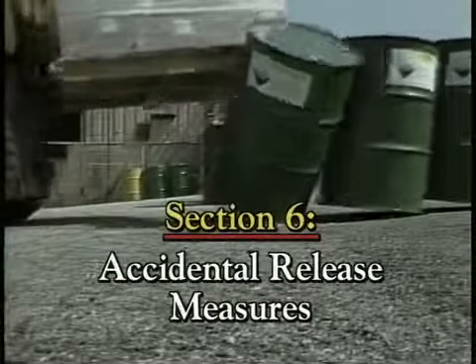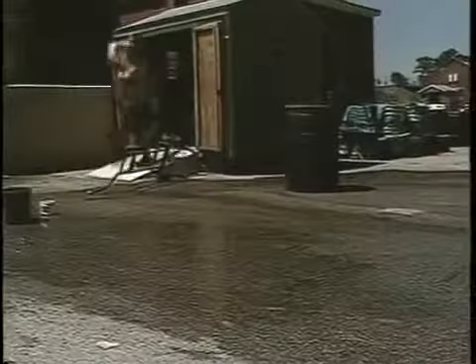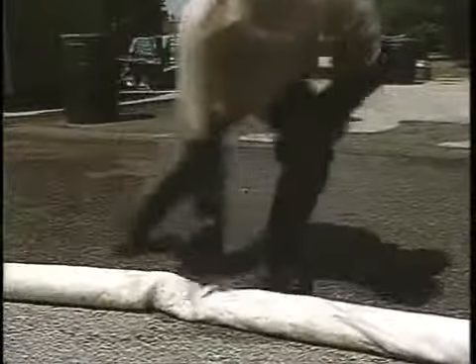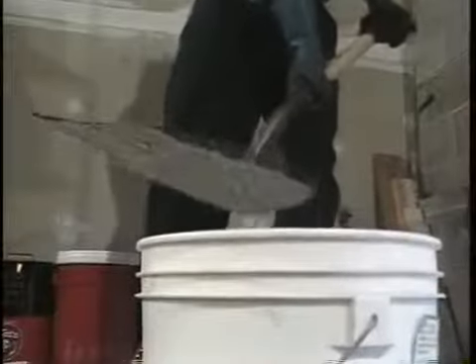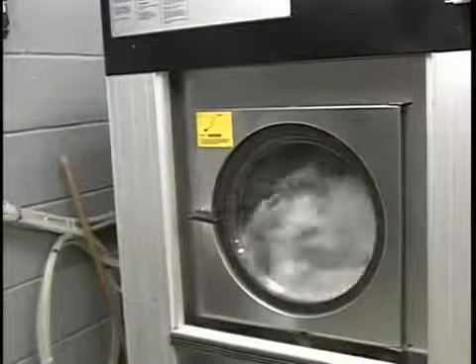Section 6 tells you what to do in case of accidental releases, such as leaks or spills. Included in this section are general procedures for containing a leak or spill, cleaning up the hazardous material, and decontaminating clothing and equipment that comes in contact with the material.